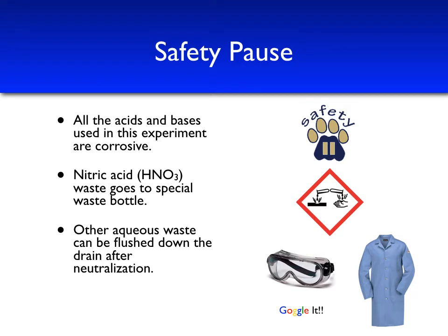For today's safety pause, we note that we are using all acids and bases for this experiment. Acids and bases have the hazard of being corrosive. Therefore, great care should be taken when handling them. If any acid or base gets on your skin, you should wash the affected area immediately with running water.